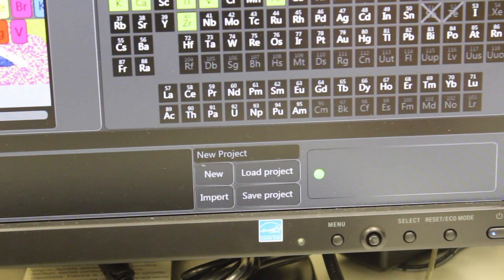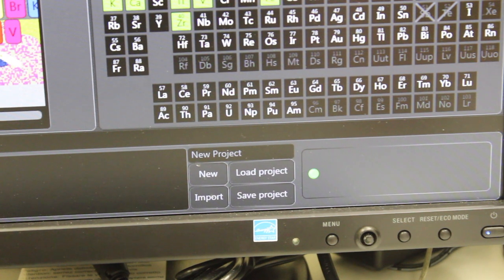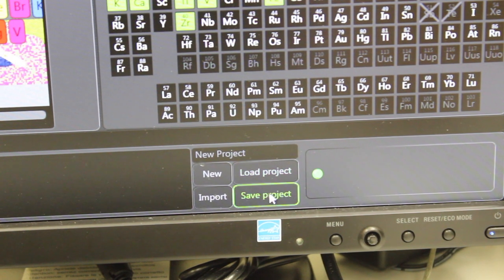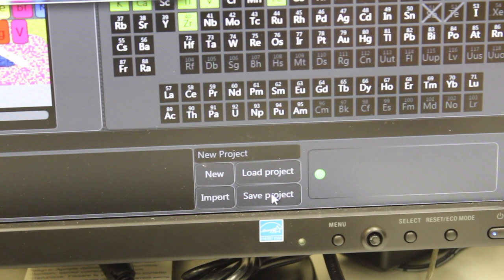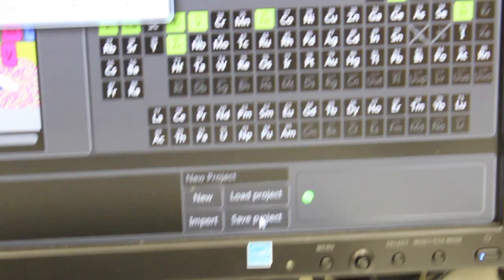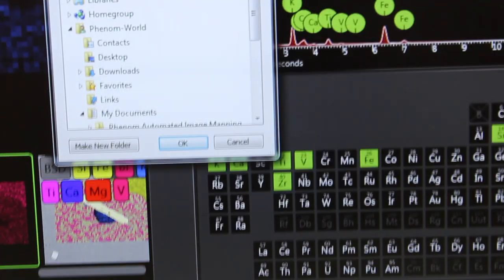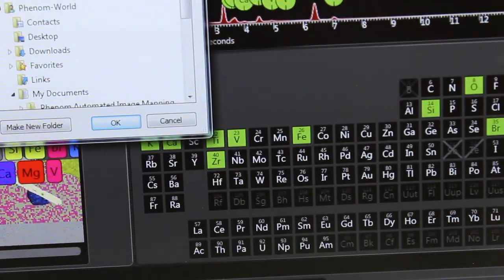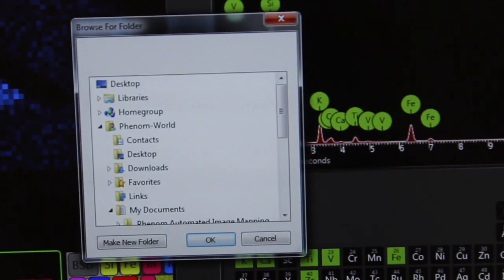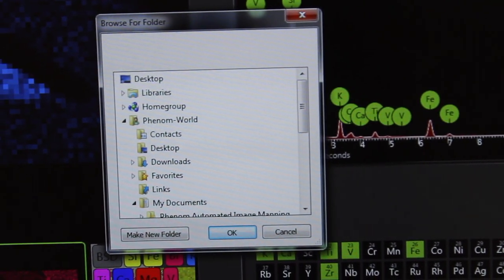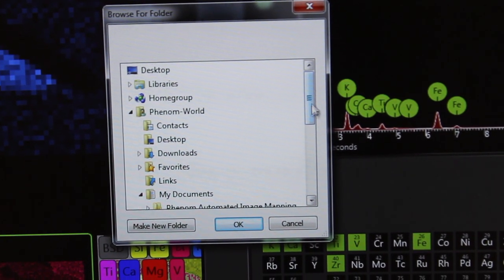To save your data, make sure that you go to the bottom of the screen and click Save Project. It will bring up a window here that will allow you to choose where to save your project.